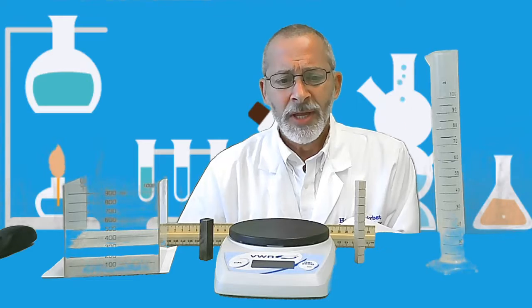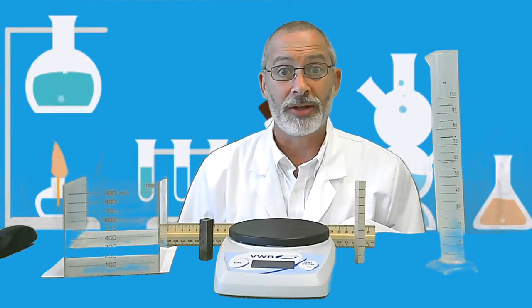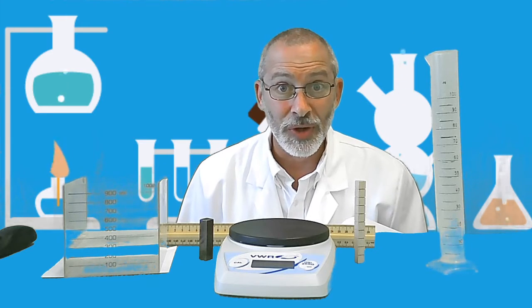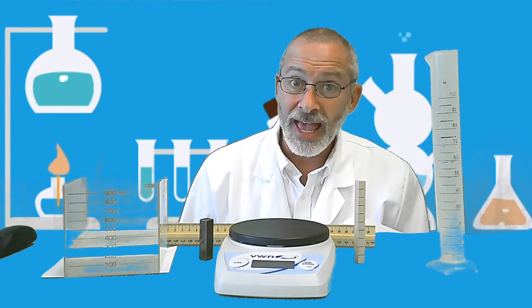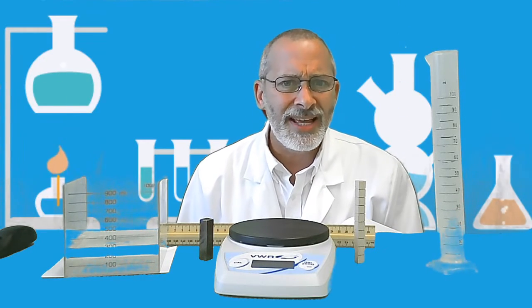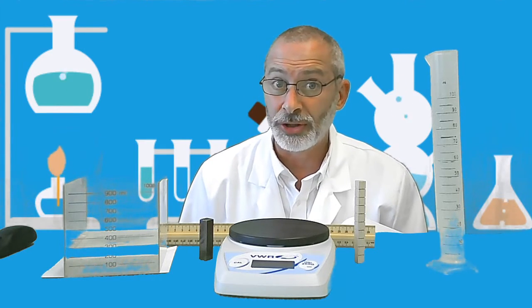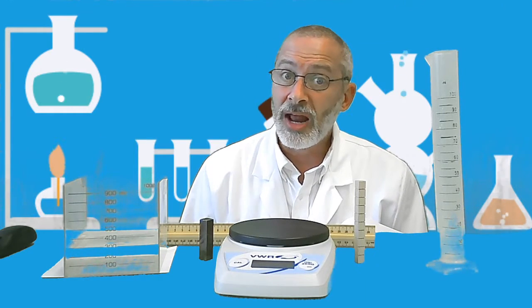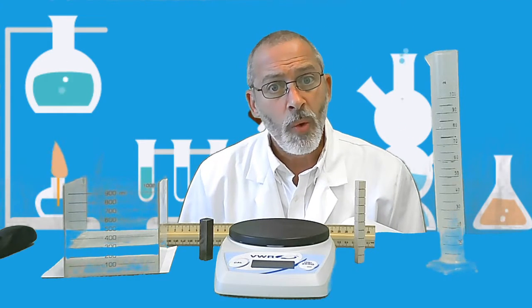Now, what this question is asking you here is this. If you find the density of another object or two, and in this case, you know that we're going to be determining the density of object A and object B. And looking at those densities, will examining the density be able to tell you whether an object will float or sink in water? What do you think?